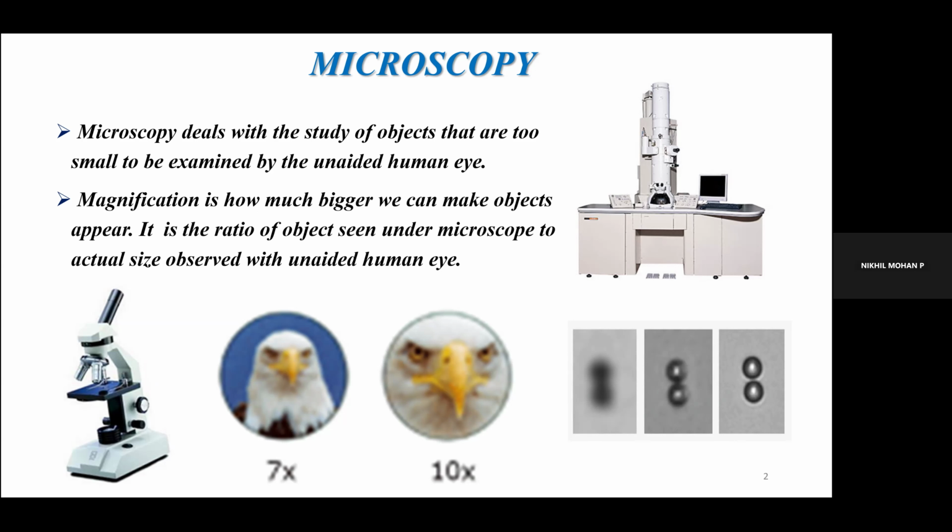Aberration means the inability of a lens to focus the source in a single point. There are two kinds of aberrations. One is spherical aberration. You know, this is a bulb. If it's light, then light is coming in a spherical path, right? So the outer side of the waves cannot focus onto the center point. That is spherical aberration. And if we generate an electron beam or light photons, the wavelength or the velocity of all the beams may not be the same. So it's difficult to focus all those beams to a single point. That is chromatic aberration. These kinds of aberrations are there in our optical system. Because of that, we cannot get these theoretical values in practice. These are all the basics about our optical microscope.